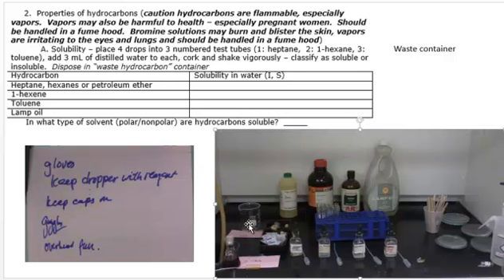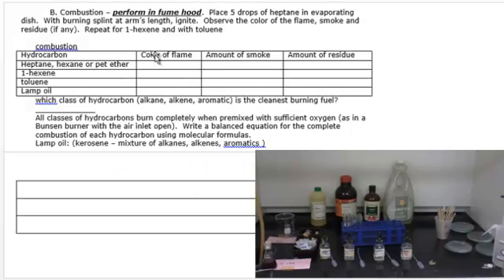But you will do 2 other experiments with this. The next experiment is to look at combustion, and you can use each one of these, but you're going to look at the difference in the amount of saturation and what it does to the color of the flame.